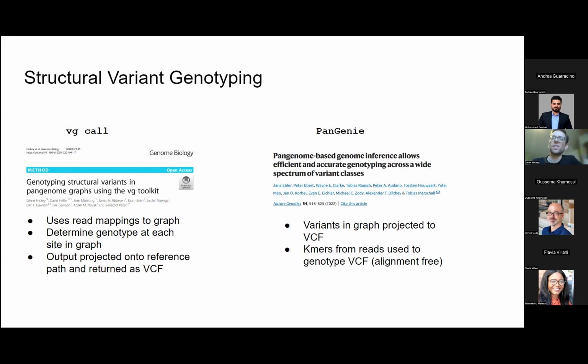And so doing that, you could leverage the pangenome without worrying too much about new formats. So say you want to run a state-of-the-art variant caller like DeepVariant, which only works on BAMs, on linear references, and you want to look at your variants in VCF, well, you could still use the pangenome. You map your reads to the pangenome, then you project them back to BAM, and then you use that for the variant calling pipeline you're used to. And we've shown that you could actually get quite a big accuracy boost by doing that. That's what we're showing in both slides here. This applies across the genome.